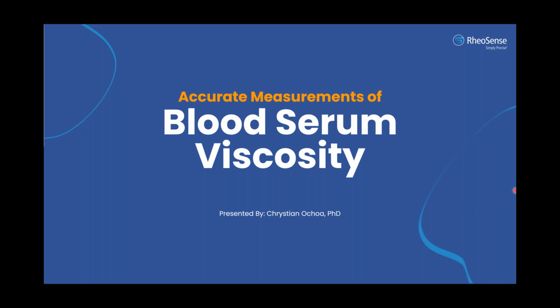Hi, everybody. Thank you so much for joining the webinar today. As you know, the title of the webinar is Blood Serum Viscosity. We're going to be talking a lot about blood serum viscosity, why it's important. We're going to show data results we can get. We'll be showing real-time results as well. So let's go ahead and get started.